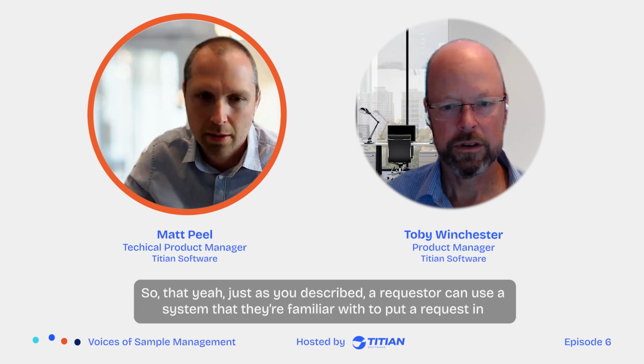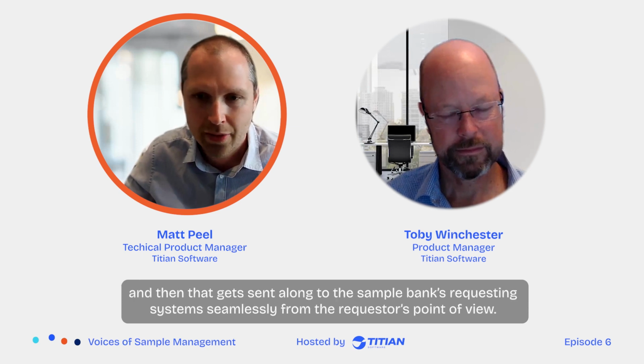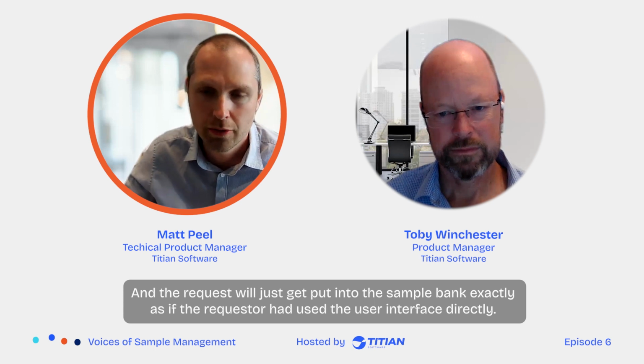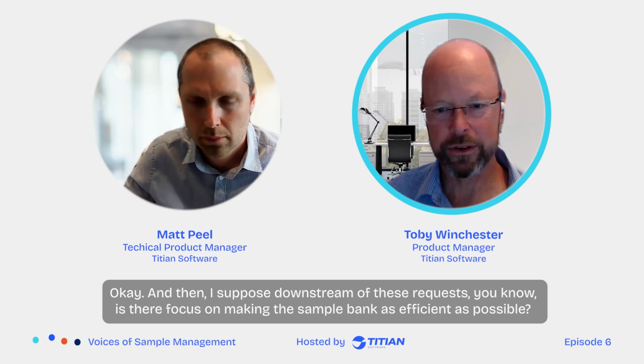So just as you described, a requester can use a system that they're familiar with to put a request in, and then that gets sent along to the sample bank's requesting system seamlessly from the requester's point of view, and the request will just get put into the sample bank exactly as if the requester had used the user interface directly.